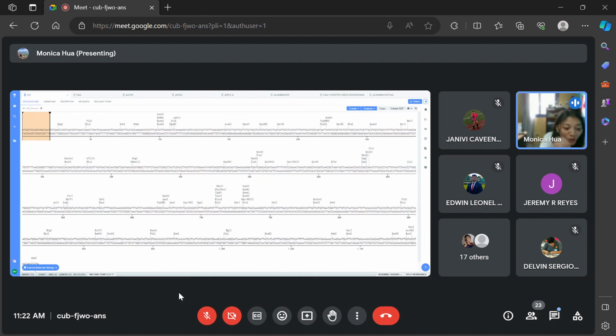Now, you don't even have to click it. Beside the length, you have something called the GC, and you have something called the melting temperature. Remember, we talked about Tm, or melting temperature, in class. The melting temperature is the temperature where the primer, because primer also comes double-stranded, hold on, let me think about it. No, actually, they don't come double-stranded.